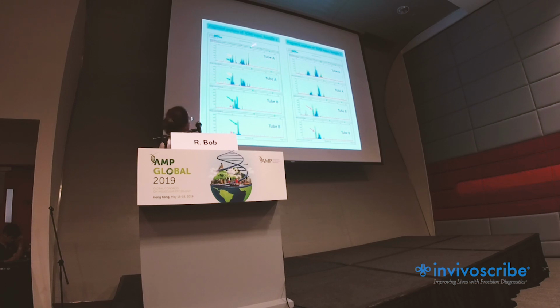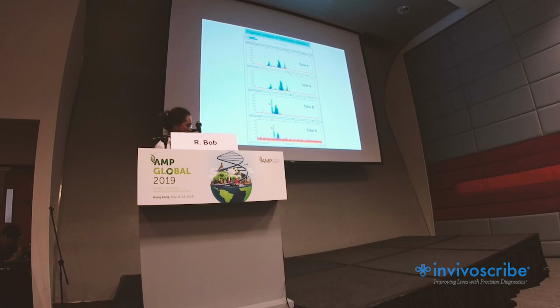You see that the peaks in tube A have disappeared. We have one dominant peak in tube B, but it's not the larger one from the previous time, but the smaller one, which is now significantly dominant. Okay, what could it mean? We still wait. The patient has autoimmune disease, so I said, wait, it's not so aggressive, so we can wait, and after 3 months, please send us a third sample.